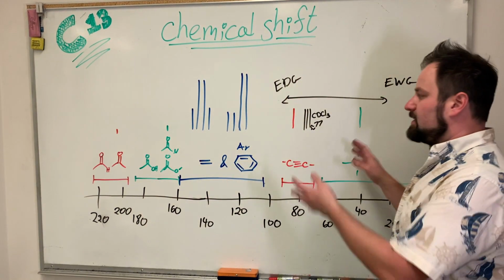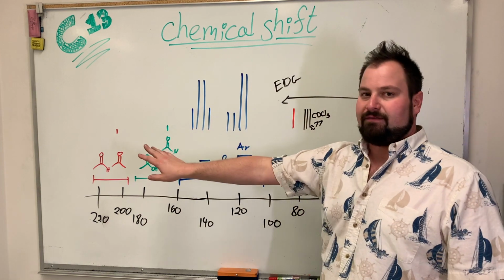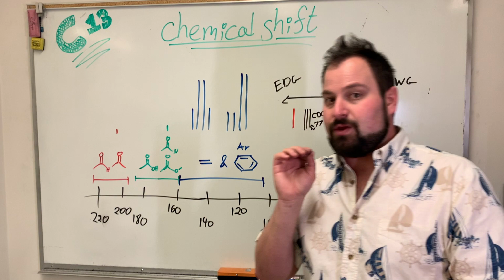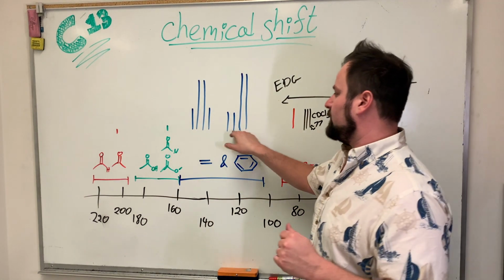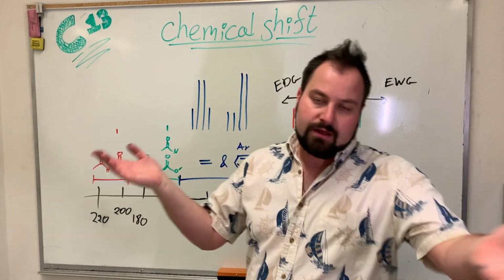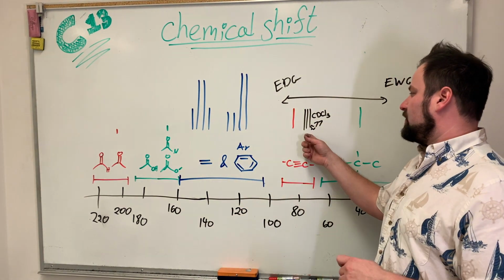You can figure out how many carbons you have by counting how many peaks you have. But these are, of course, unique carbons. So if you have symmetric ones, they will show up in the same spot. So that'd be 1, 2, 3, 4, 6, 7, 8, 9, 10, 11, 12 for our kind of nonsense thing here. Ignoring, of course, this.